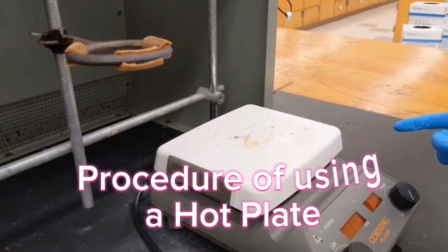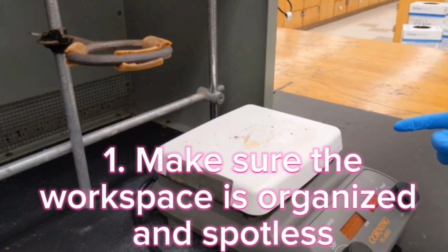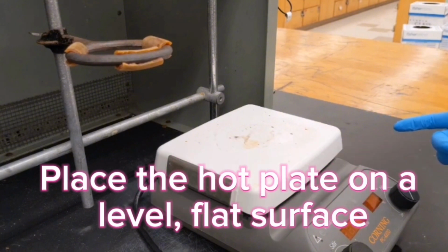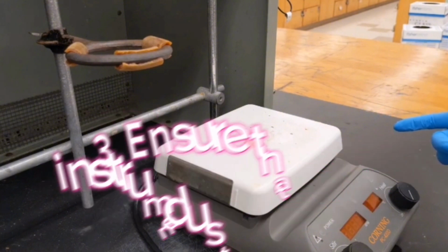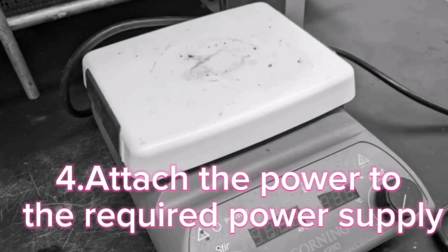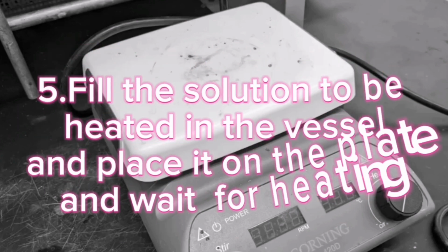Let's proceed to the procedure of using a hot plate. The first procedure is to make sure the workspace is organized and spotless. Second, place the hot plate on a level, flat surface. Number three, ensure that the instrument is clean and dust-free. Fourth, attach the power cord to the required power supply. But the power cord must not be attached to the top plate because it is hot, and there is a possibility that the power cord will burn or get damaged.